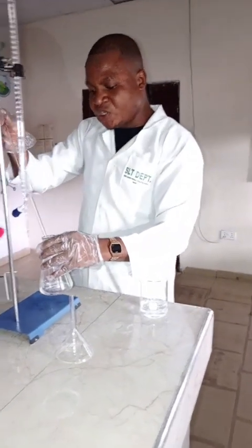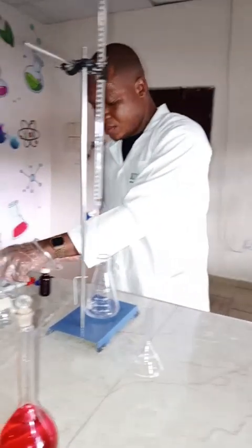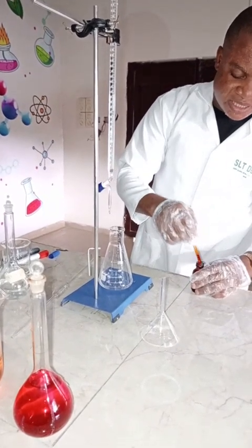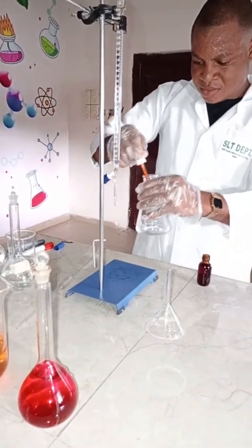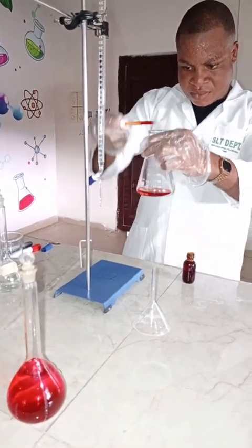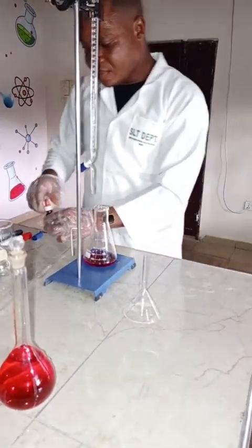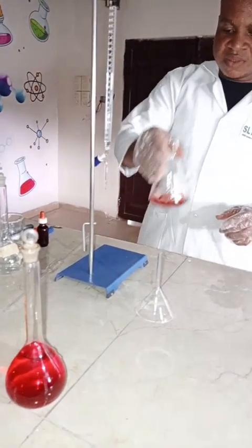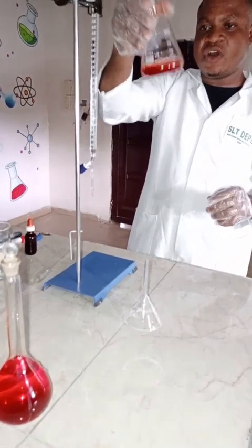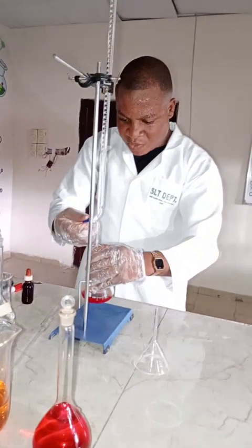This is another 25 ml portion of the base. I'm going to introduce 2 drops of my indicator, methyl red. This is 1. That is 2. Now this is our starting point. You know the color. Our starting point. I'm going to titrate.